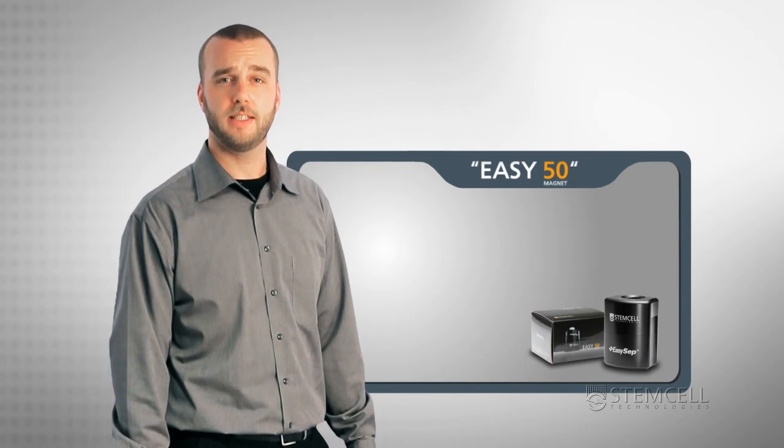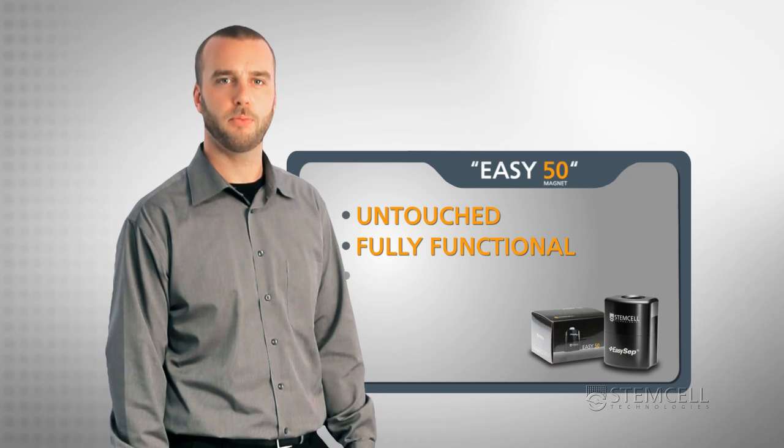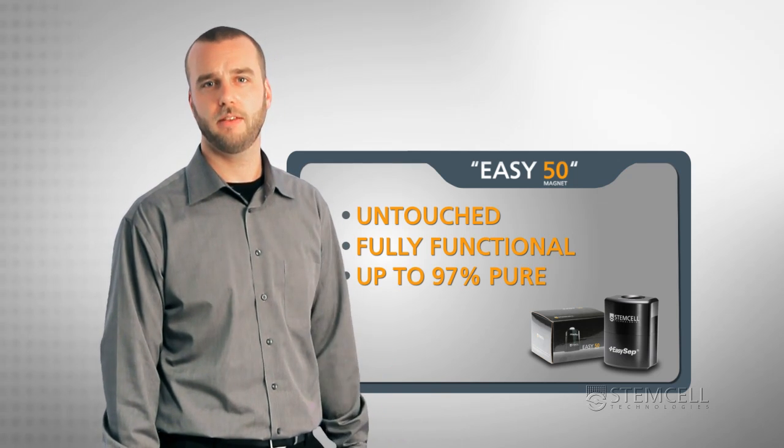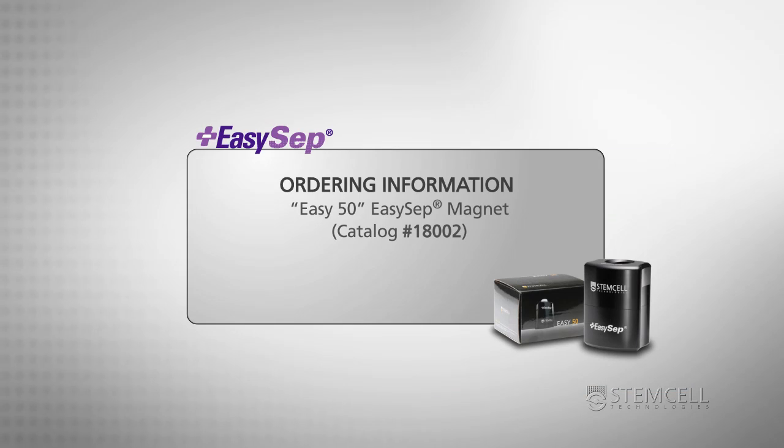Cells isolated with the EZ50 Magnet are untouched, fully functional and up to 97% pure. EZ50 provides you with a fast, reliable method for isolating cells from large sample volumes. For more information on the EZ50 Magnet, email us or visit our website at stemcell.com.